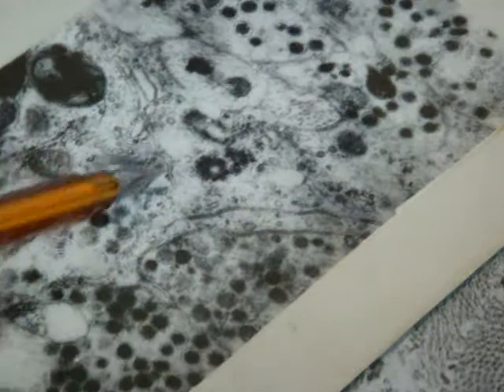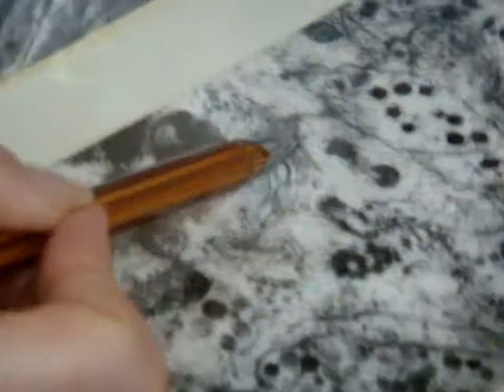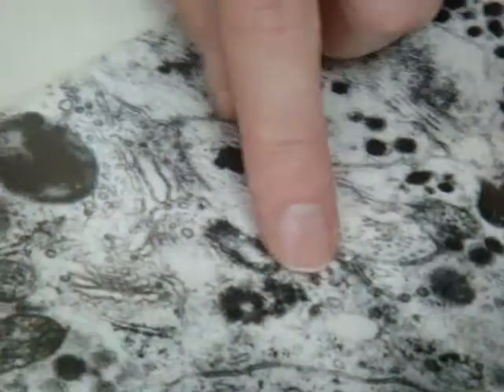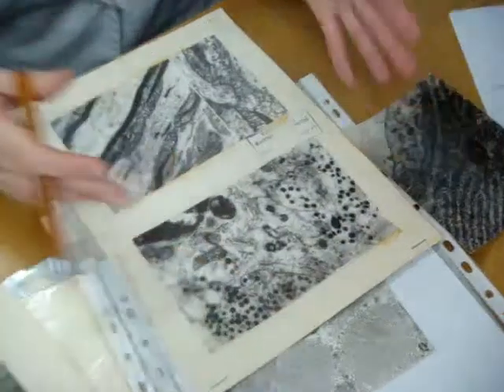Here we can see mitochondria, Golgi apparatus. What is it? Centriole. So I can guess that something here will be the borderline of a nervous cell, because the organelles belong to the nerve cell. These are processes that come to this nervous cell and form synapses on the body. If you remember, we name this neuropil, because sometimes it is not understandable which process comes to which, where the synapse is, and so all this we name neuropil.